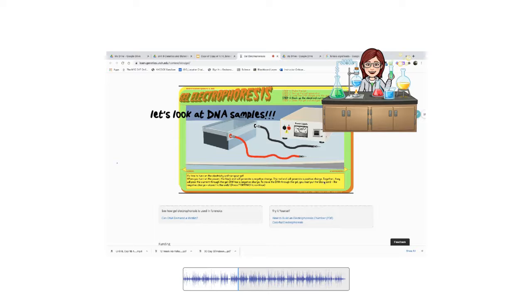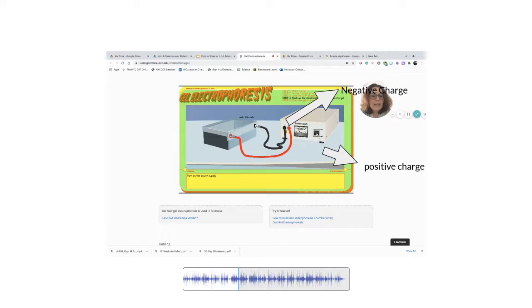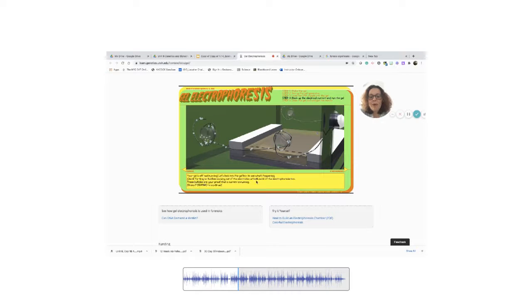Okay, let's turn on the machine. Just plug the end of the black wire into the black plug to generate a negative charge, and same thing with the red one to generate a positive charge. And now let's turn on the machine. These bubbles are your proof the current is running.